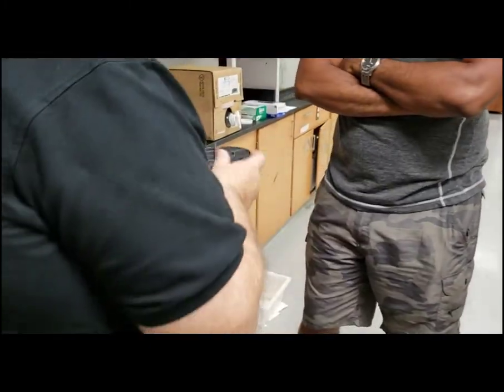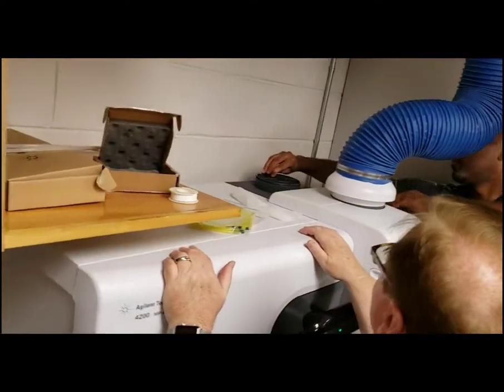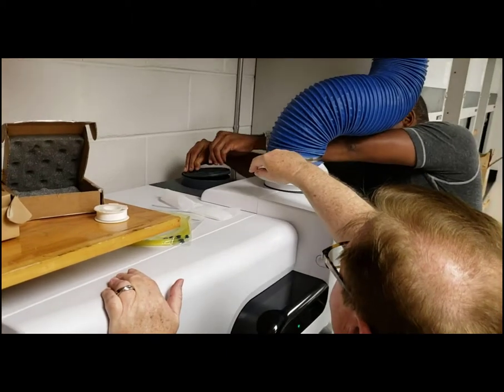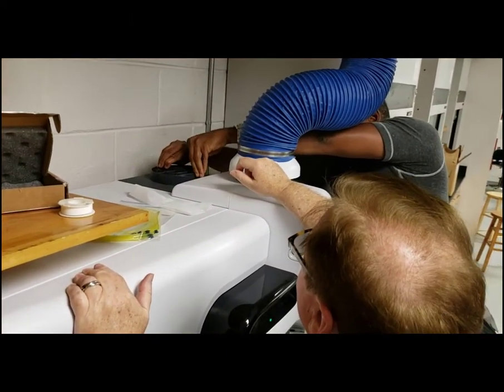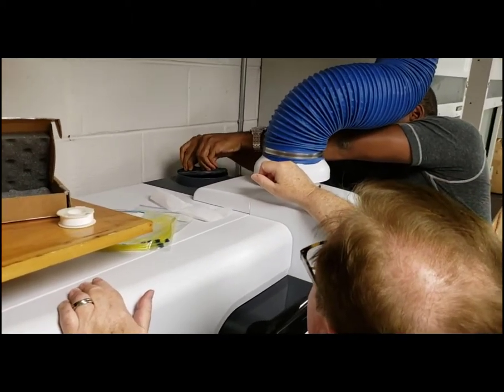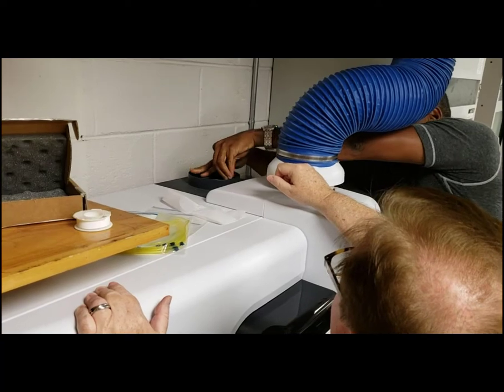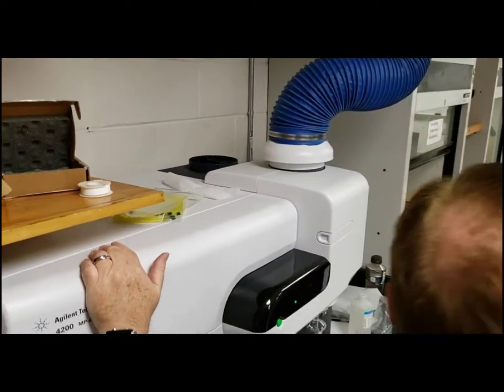Okay. Now to put it back, you put it back this way. That's what that guide is for. Tilt it down on the back, and then snap it in. Make sure you're in that. Yeah, see that. And then once you've taken it out a couple times, it's not as hard.